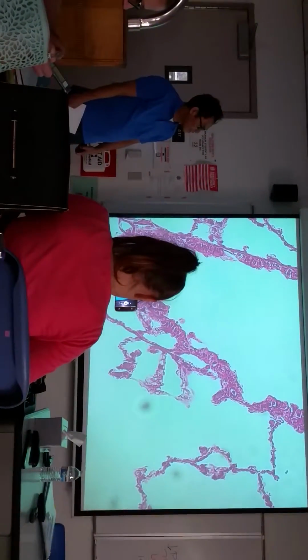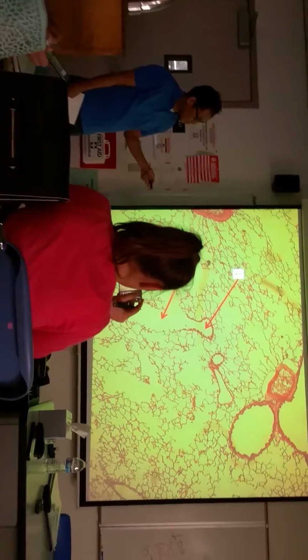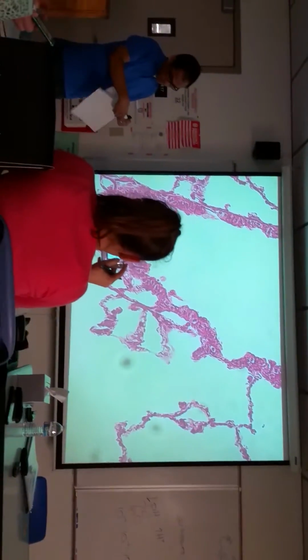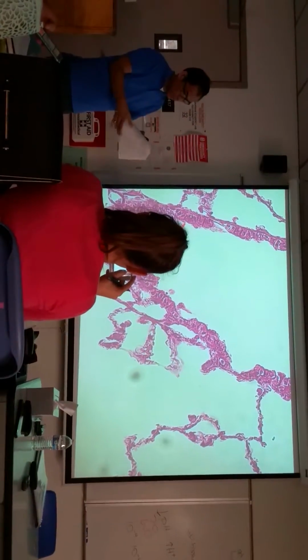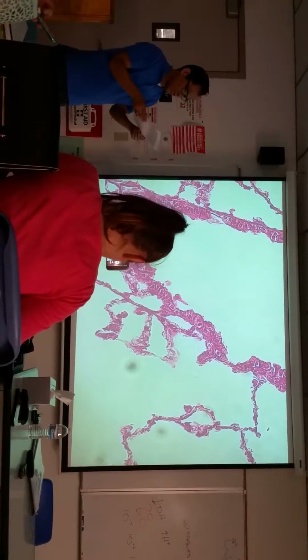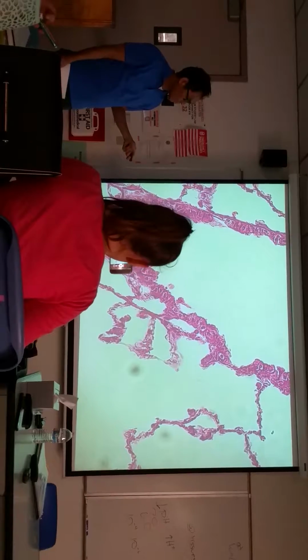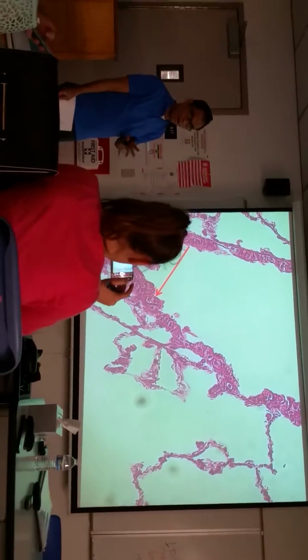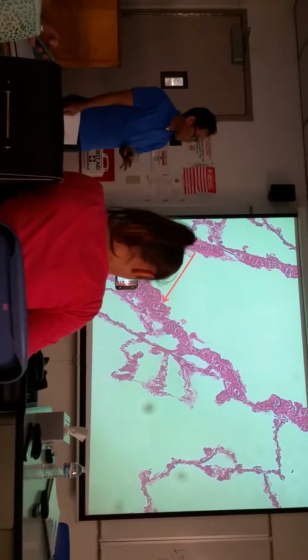I wanted to show you a close-up picture of that epithelium. Also on your study guide for bronchiole: the epithelium for bronchiole, I say on the study guide, is simple cuboidal epithelial tissue with sparse cilia. So that would be the answer for this identification. It doesn't look like that columnar or goblet cell stuff, does it? It's very different in the bronchioles.